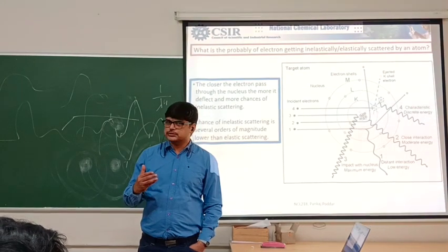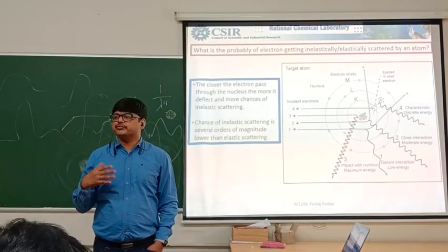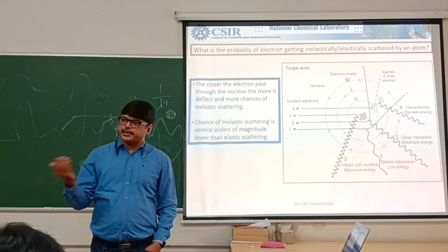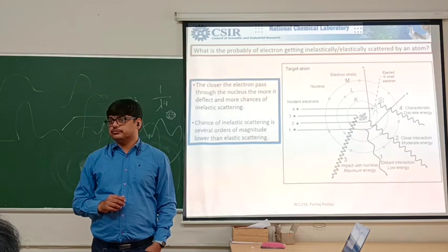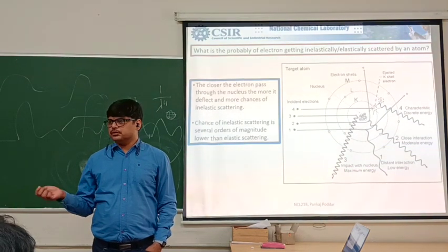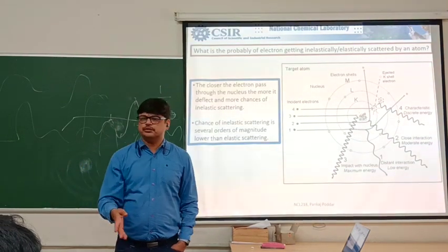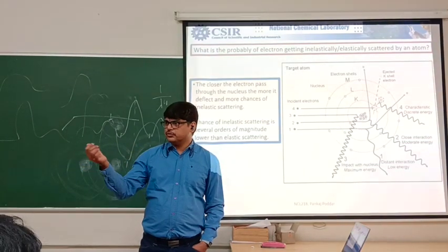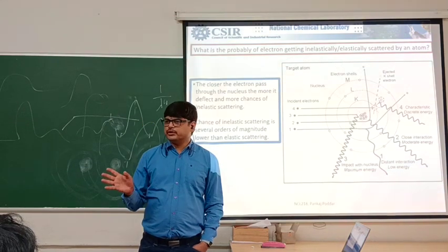I would say that when you use electrons, or even photons, polymers naturally have a very weak signal because these electrons scatter, they are lighter elements. So the signal from polymers is inherently very faint. In contrast, metals on the periodic table give a beautiful signal. If you are doing DLS, dynamic light scattering, particle size analysis, they give you a beautiful signal.